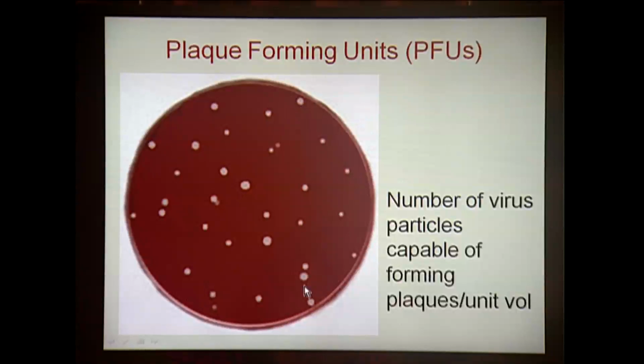Theoretically, if one bacteriophage infects one host cell and grows inside it and then lyses that host cell and infects the neighboring cells, then one plaque will be formed. So, counting the plaques, we can calculate the number of phages present in a given sample. Though in practice, we represent the result as plaque forming units.